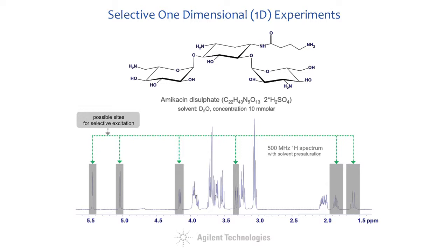We use a 500 megahertz DD2 console and a 1 NMR probe. The structure of amikacin consists of three sugar units and an aliphatic side chain corresponding to four isolated spin systems in the molecule.